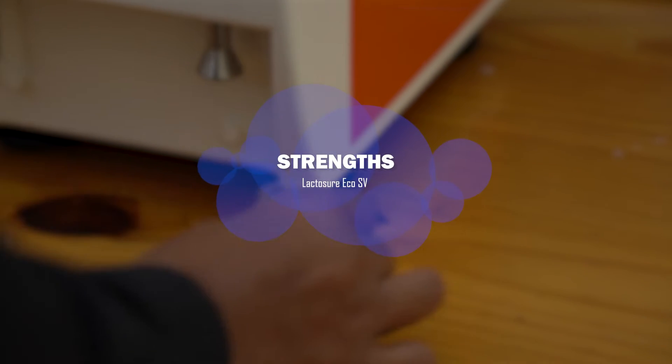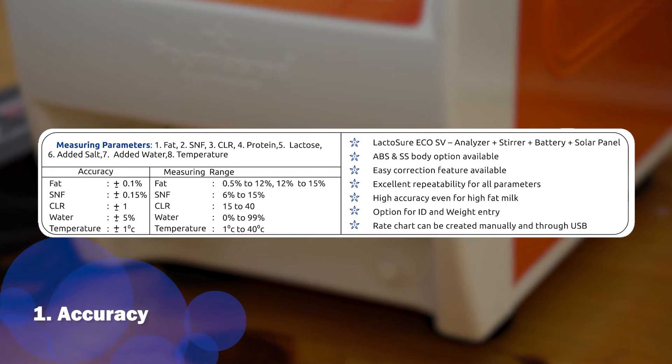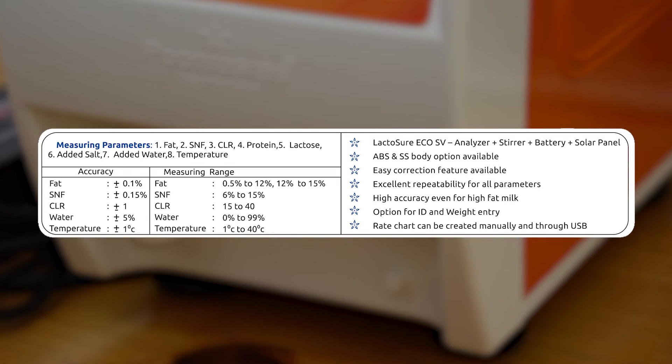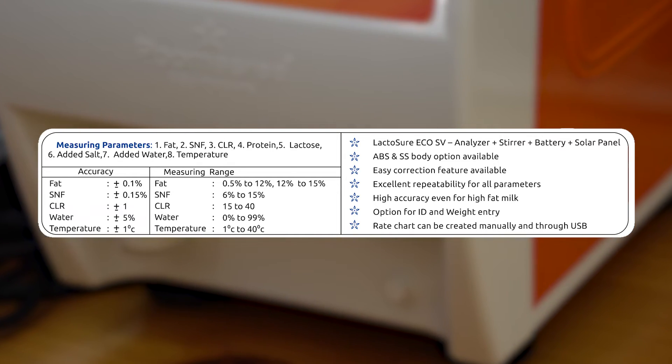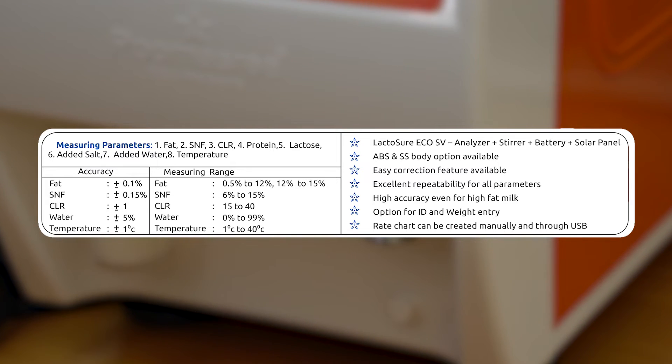Strength of Lactosure Eco SV. In terms of accuracy, Lactosure Eco SV has an accuracy of plus or minus 0.1 for fat and plus or minus 0.15 for SNF, even for high fat milk, with a wide range of 0.5 to 14 fat.